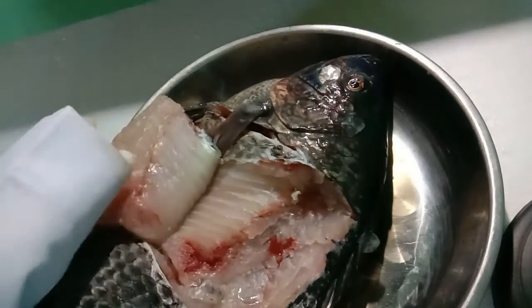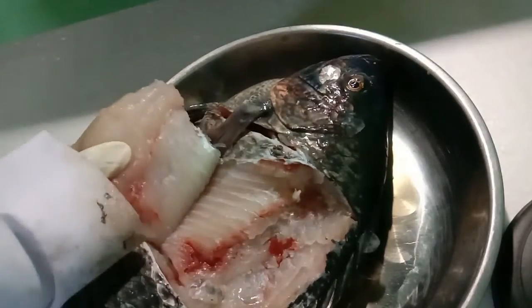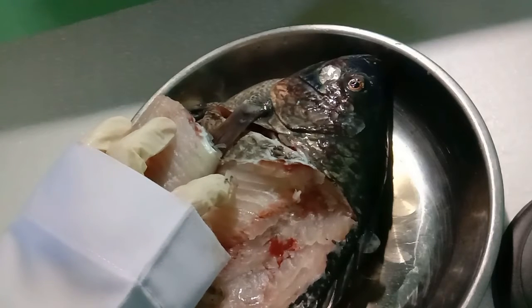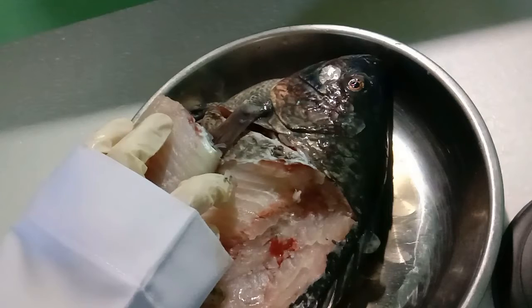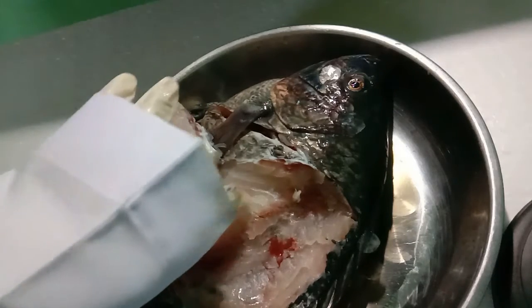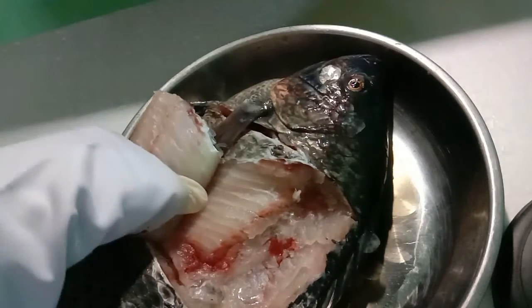And the hypaxial, you can see in the bottom, is muscles that can act through the cleithro-pectoral interface to retract the pectoral girdle, which in turn depresses and retracts the hyoid apparatus and lower jaw.